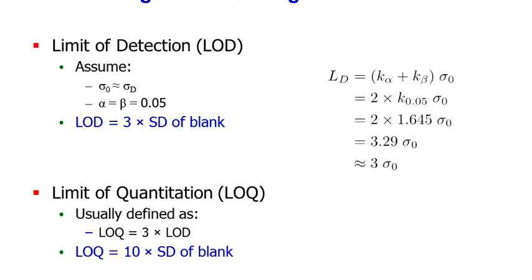Like I was saying, depending on the software you use and the instrument you use, what signal to noise represents is a little unclear. And so it would be best if you used a real blank sample and then did your measurements.